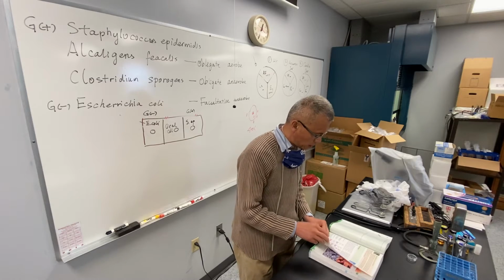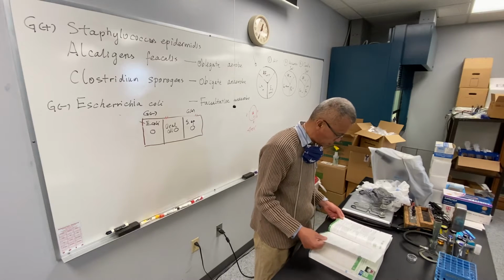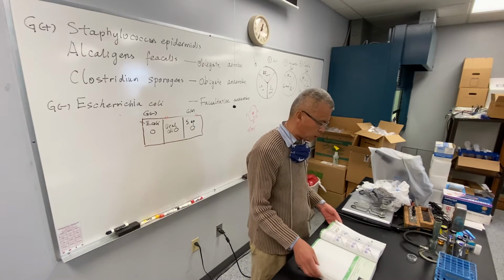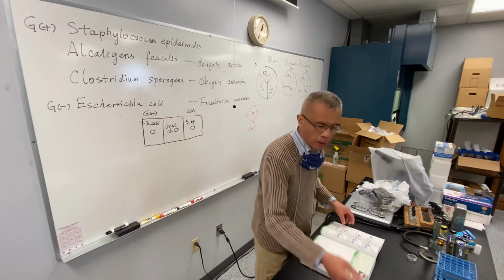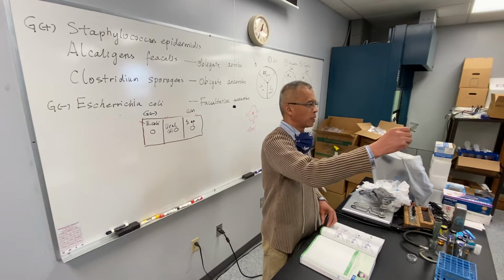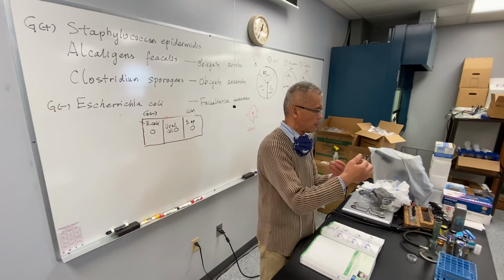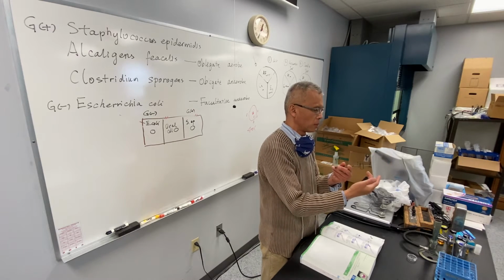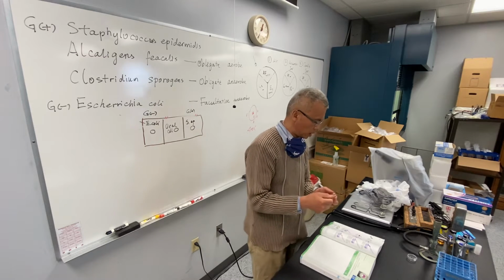Okay, now let's turn to the page in the lab manual, page 200. We're going to basically follow the procedure of the Gram stain operation. First of all, you have this slide, right? Take one of the slides and make three portions, three areas. You can use a marker on this side and put a mark, and put the cells on the other side, not the same side, so the marker won't get messed up with your staining.